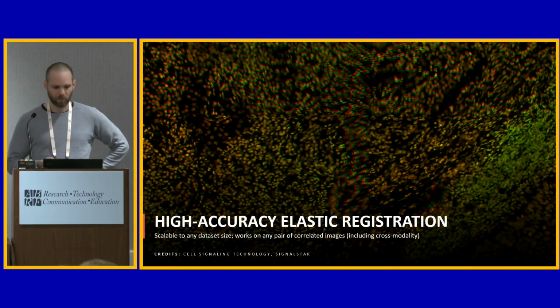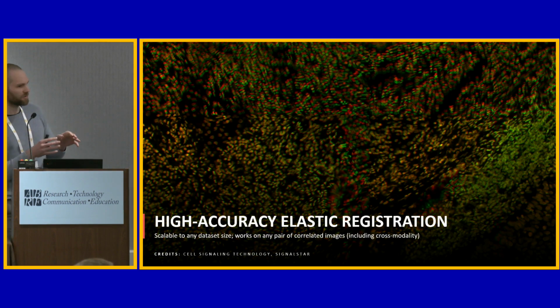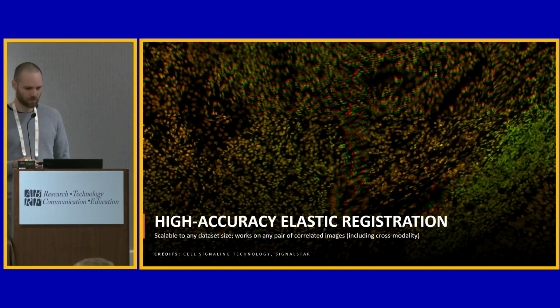The elastic registration is highly accurate. It might be a little bit hard to see from the back, but basically you see that there's sort of subtle deformations moving in different directions that the tool is correcting in this case.